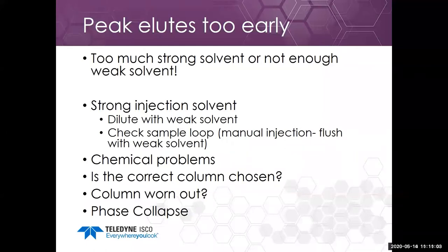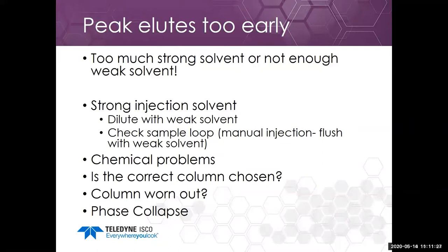Also check your sample loop if you're doing a manual injection. Whatever the previous run finished at will remain in the loop. If the last run had a wash step with 100% B solvent — considered the strong solvent — the loop will be filled with strong solvent. Even if you dissolve your sample in water and inject it, the loop is still filled with strong solvent and that could cause your compound to elute very early.